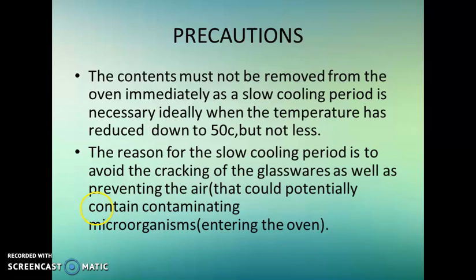Another precaution: the contents must not be removed from the oven immediately, as a slow cooling period is necessary. After we switch off this hot air oven, we should not immediately open the door. We should allow for slow cooling, because even though we are switching off the power supply, the temperature will be very high.